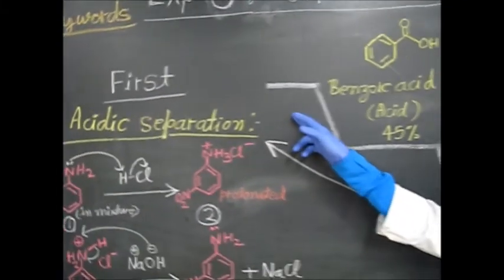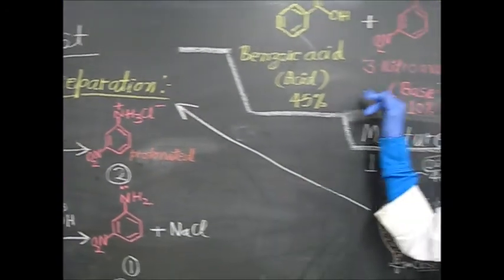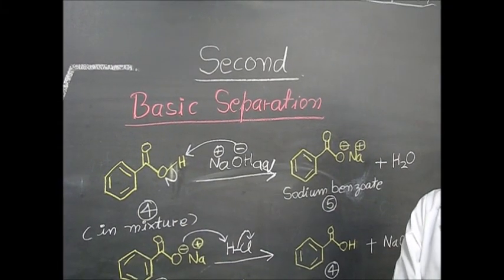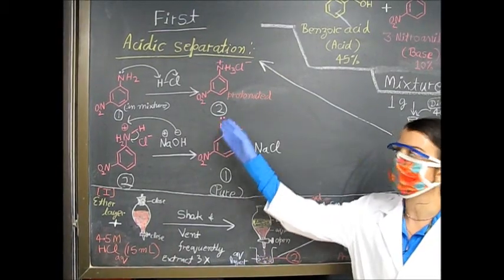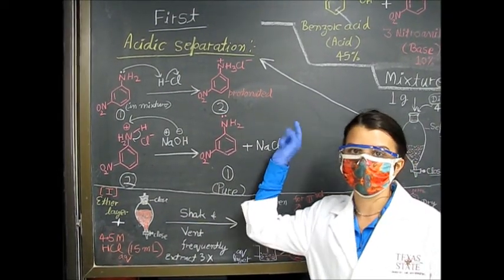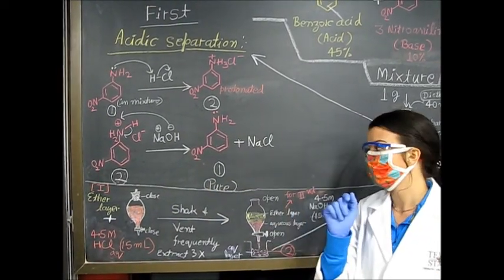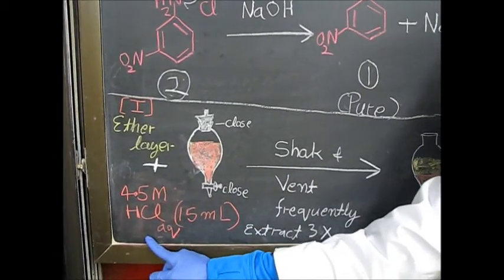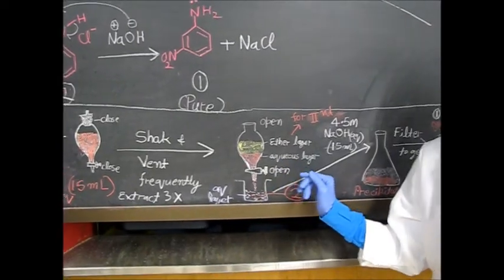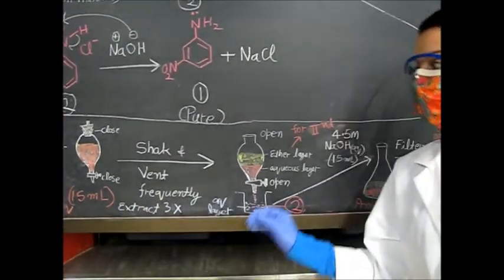The first step of this extraction is going to be an acidic separation. We will be using HCl to separate out the 3-nitroaniline compound, which is a base. The second step is a basic separation — we will be using NaOH to extract out the benzoic acid from the solution. In the acidic separation, we will be adding HCl into our mixture, which will protonate the nitroaniline. Once protonated, it is soluble in aqueous conditions. We add 15 milliliters of 4.5 molar HCl, shake the separatory funnel, and invert it to release pressure. We will then extract the bottom aqueous layer, repeating this procedure three times with three sets of 15 milliliters of HCl to ensure all of the compound was protonated.